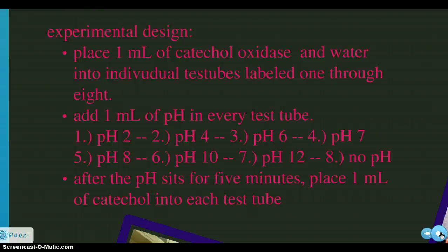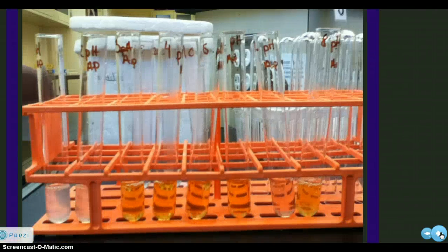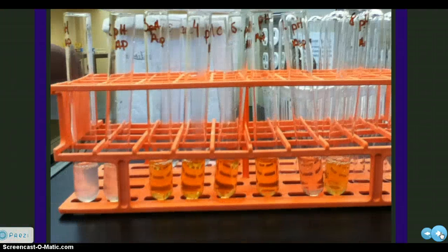After the pH sat there for about 5 minutes, we put 1 ml of catechol into each test tube to find the results. And this is our before picture. They're in order, and they're looking kind of cool, just chilling there. And this is our picture after about a good 15 minutes.